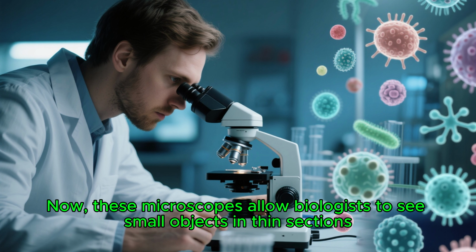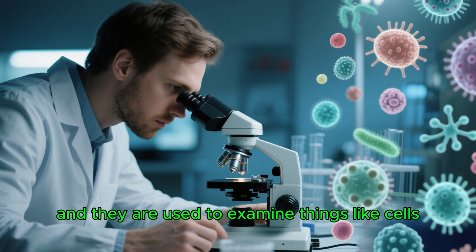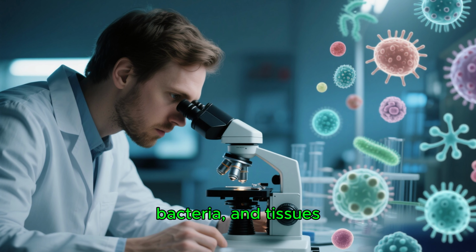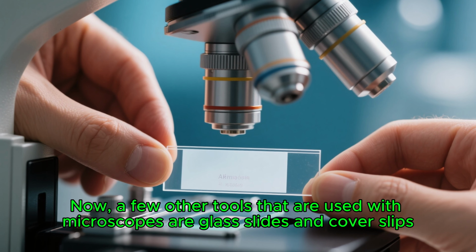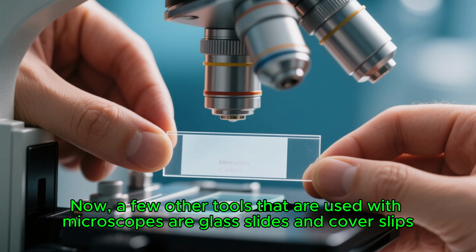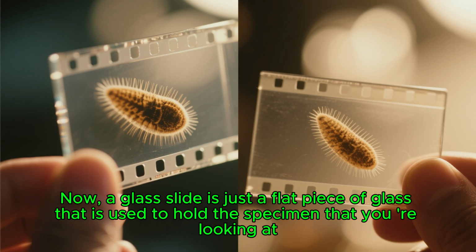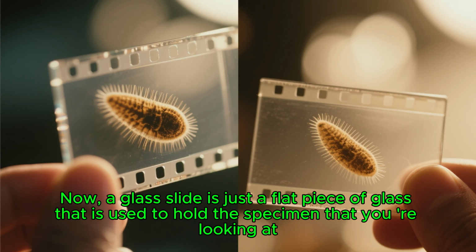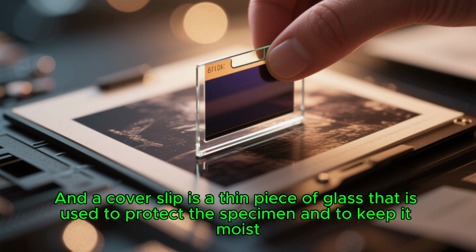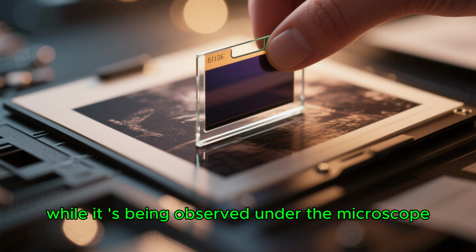Now, these microscopes allow biologists to see small objects in thin sections, and they are used to examine things like cells, bacteria, and tissues. Now, a few other tools that are used with microscopes are glass slides and cover slips. A glass slide is just a flat piece of glass that is used to hold the specimen that you're looking at. And a cover slip is a thin piece of glass that is used to protect the specimen and to keep it moist while it is being observed under the microscope.